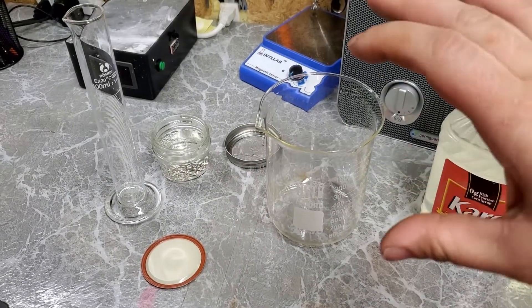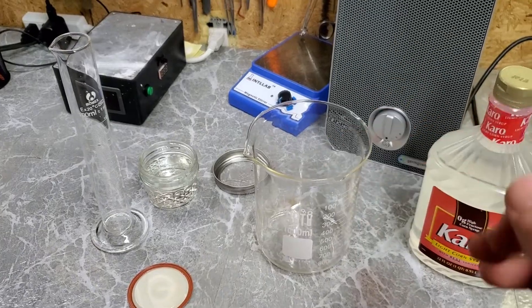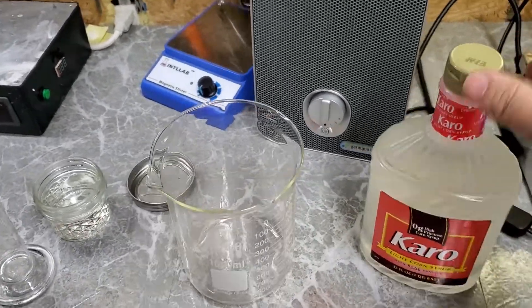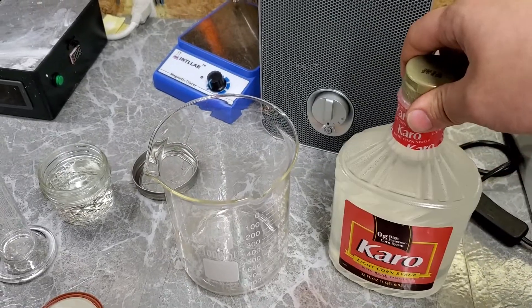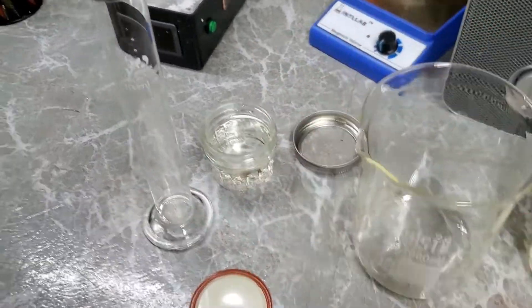I'm going to show you one of the easiest ways you can make your own liquid culture for growing mushrooms at home. This is going to be incredibly simple. All we need is some corn syrup and water. That's it. That's literally it.